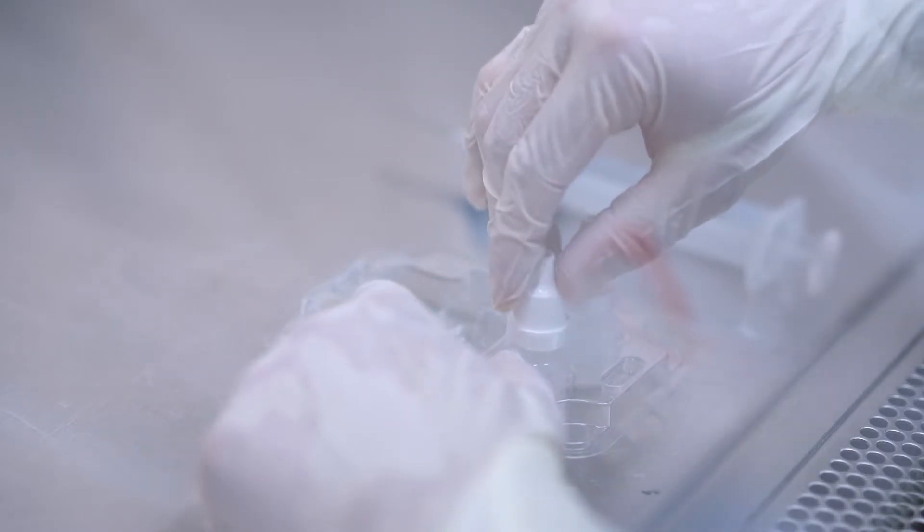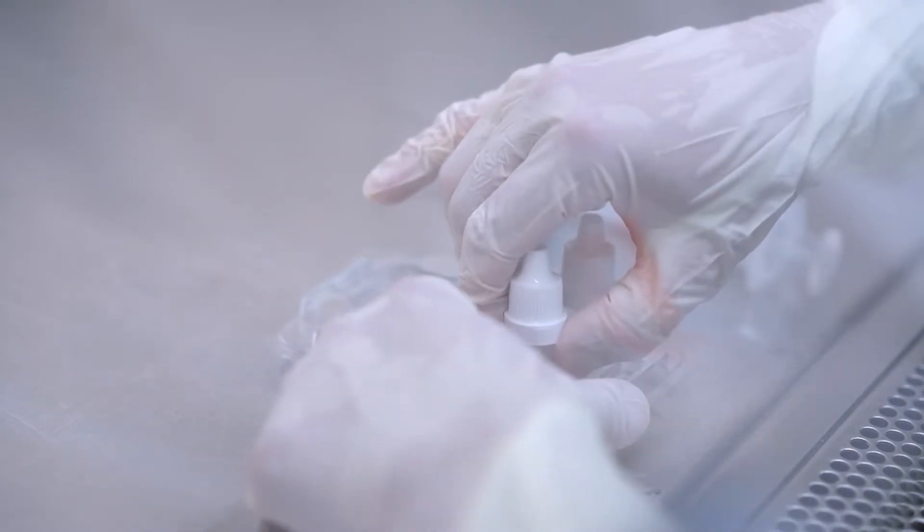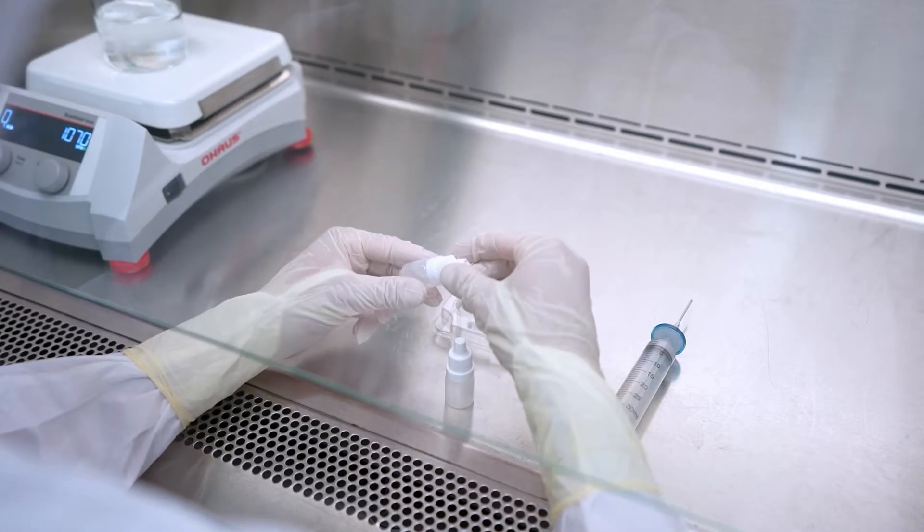Each bottle comes with a leak-resistant screw cap with the tips partially fixed within, eliminating the need to touch the sterile tip when securing it to the bottle.